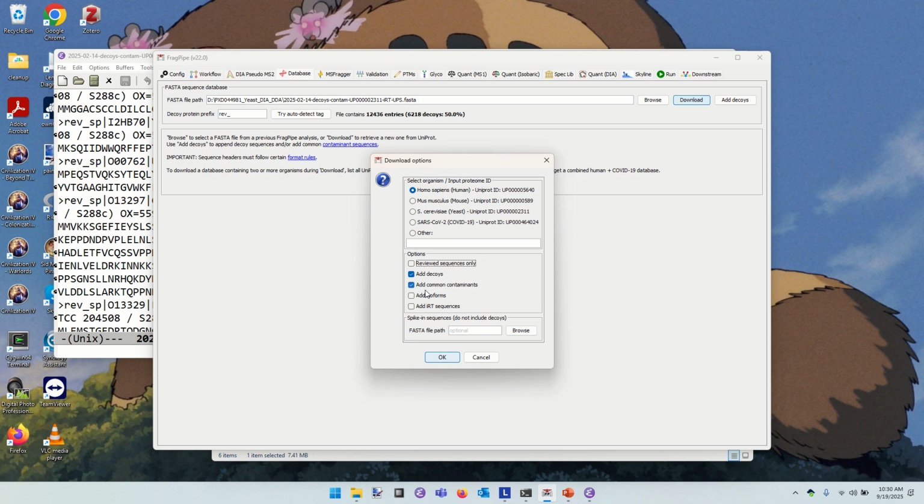The IRT peptides are important in cases where you're trying to make absolutely sure your liquid chromatography is nice and standard across the experiments. IRT peptides get spiked in to represent kind of landmarks in retention time.